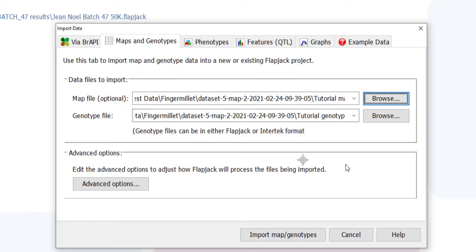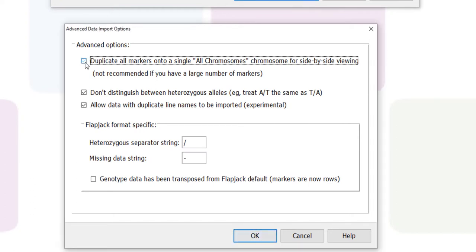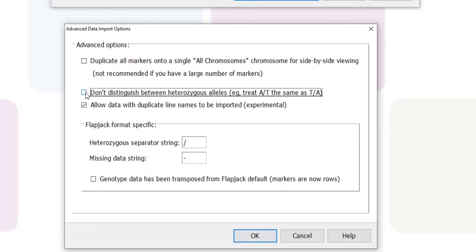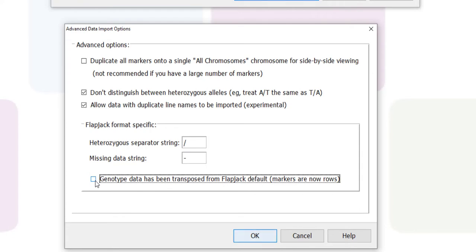Advanced import options are available which can come in very handy depending on how your data is formatted. Options available are for viewing all your markers together. Flapjack offers flexibility for heterozygous allele formatting and allows for duplicate line names to be imported. Flapjack also offers options for different heterozygous and missing data characters and can also transpose your data if required.